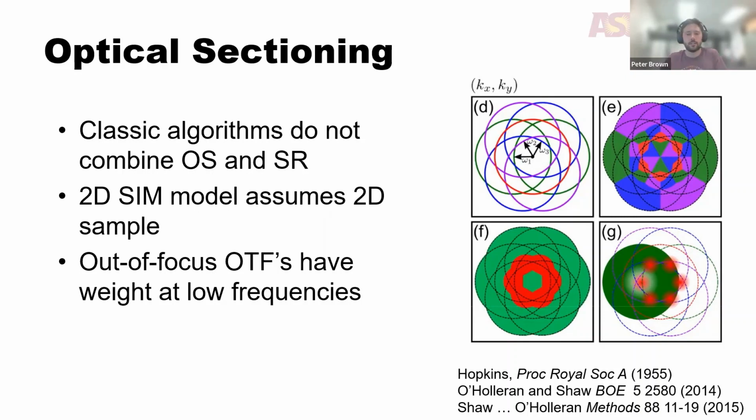And then we see it in our image, not only as an out of focus blur from the 0th band, but from the higher order bands, it can show up as sort of a hexagonal pattern or other artifact in the reconstruction. So one approach to get around this, which was, as far as I know, first suggested in these papers, is an approach called band replacement.